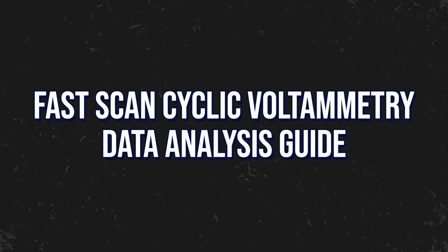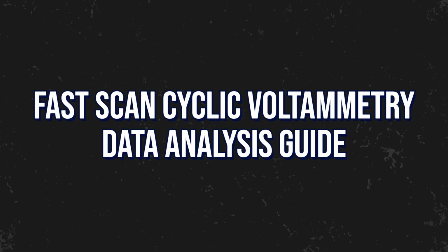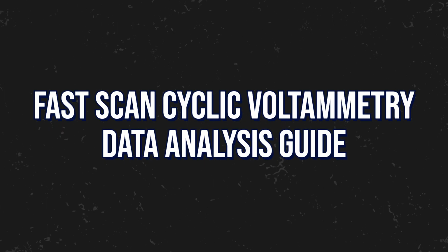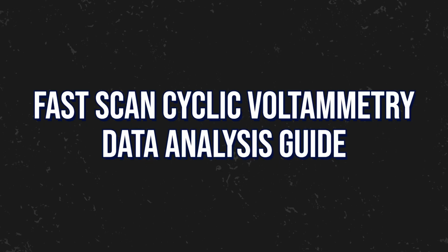Welcome back, everyone. Today we're going to go through how to export the data we collected in the last video, as well as how to prepare a simple calibration curve that you can use to extrapolate recorded currents to concentrations.